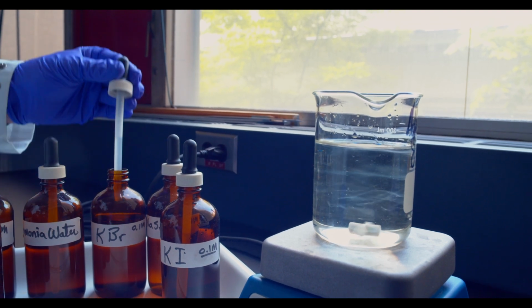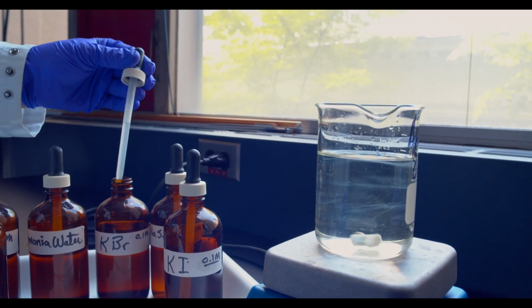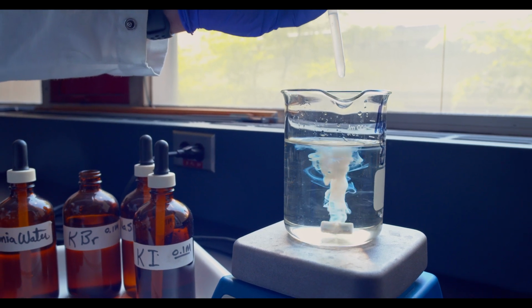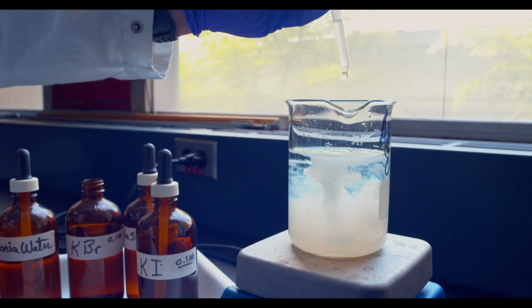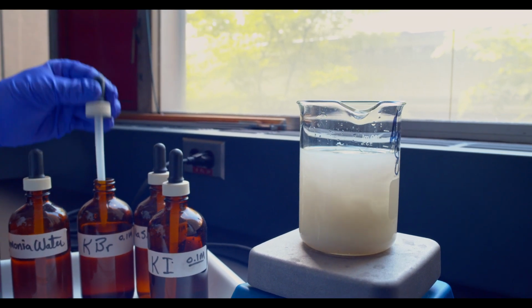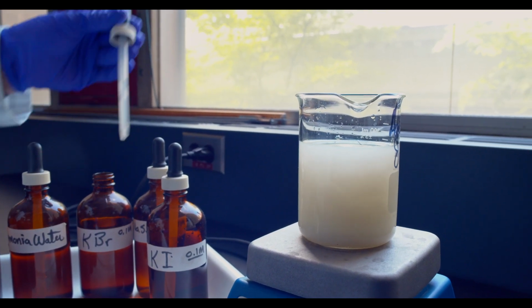So now potassium bromide, the bromide ion, will bind more tightly. So now we see a precipitate of silver bromide.